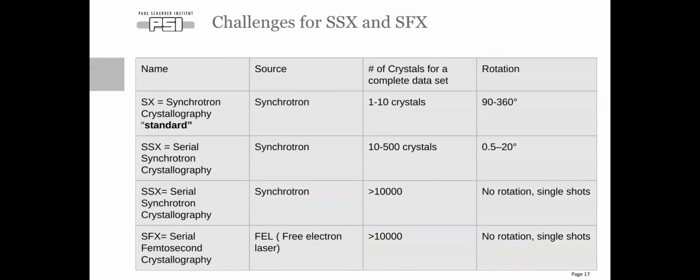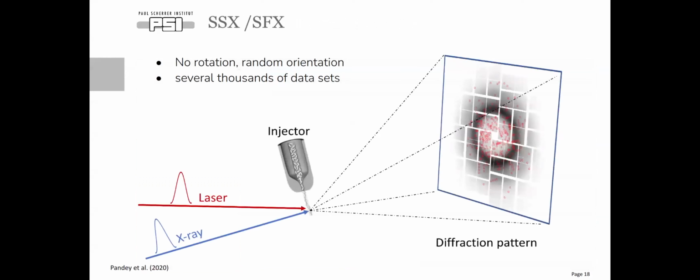So the last part I would quickly like to touch on is SFX and SSX data. So far, I was talking about synchrotron crystallography data with rotation, so still rotational wedges. And now I would like to cover a bit the challenges of serial synchrotron crystallography and serial femtosecond crystallography, where we have no rotation. I think Richard will give us a full talk about this problem, so we'll just briefly touch on it. So you know from the setup that we don't have any rotation and we have random orientations of these data sets.